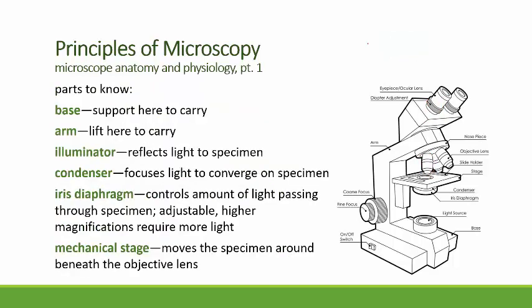Okay, so some of the anatomy and physiology then of the microscope. The base is the support area. The arm is where you carry it. So every time that you pick up and move the microscopes, be sure to hold them at the arm and have a hand underneath the base.